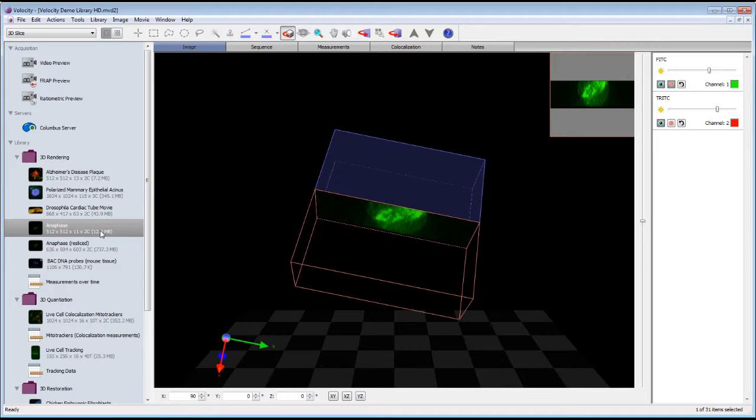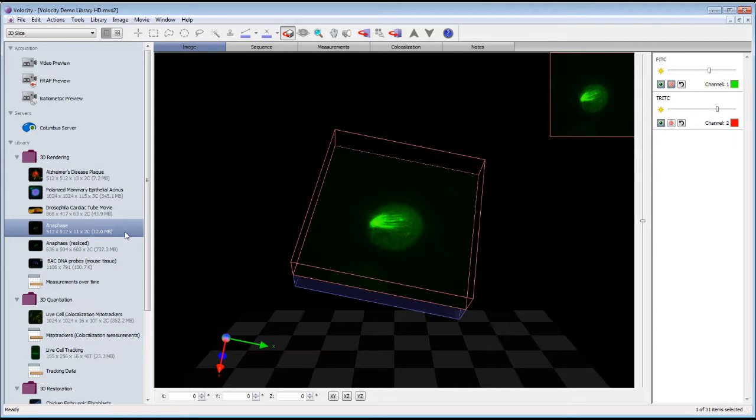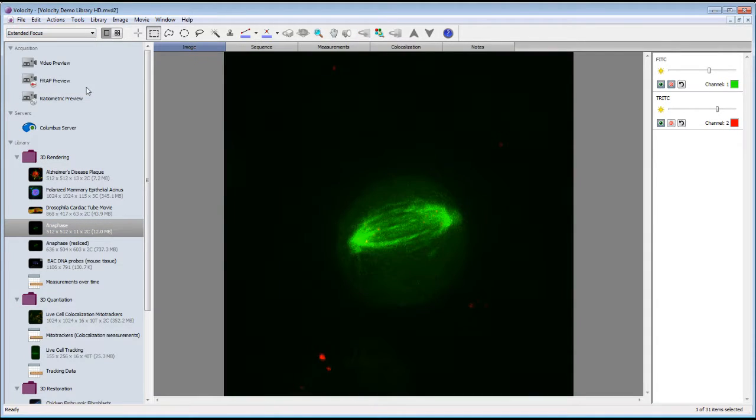As a useful tip, the shortcuts to XZ or YZ orientations of the slice view can be used to generate a different extended focus merge. The extended focus mode of the image view is a brightest point merge of the XY planes in the stack.